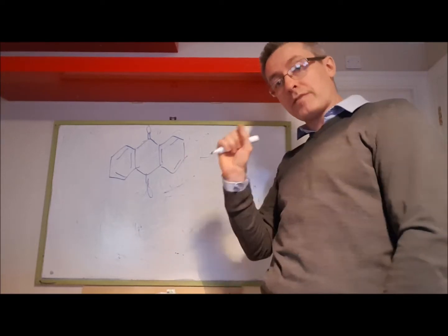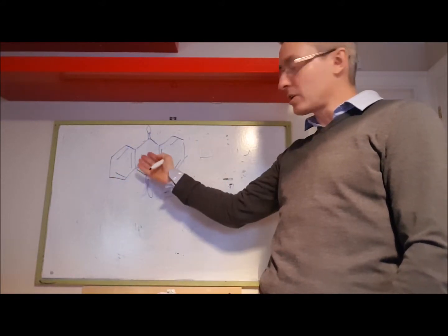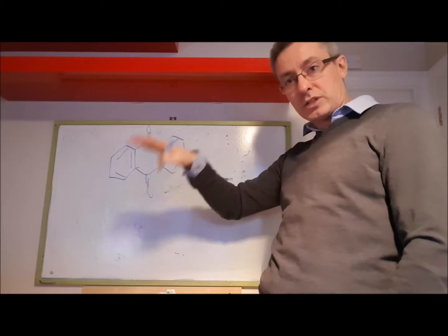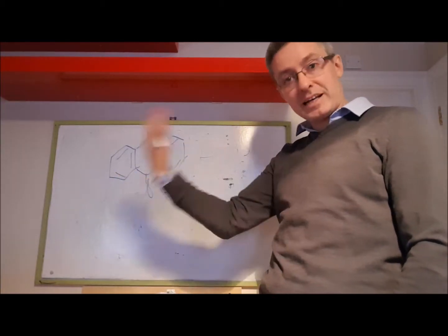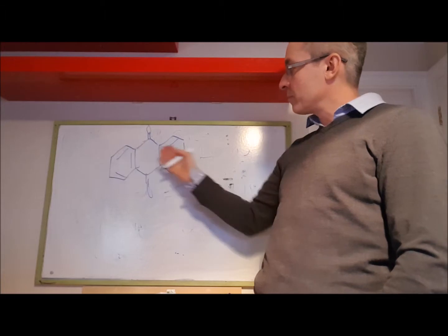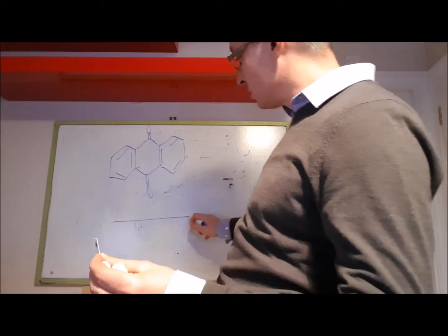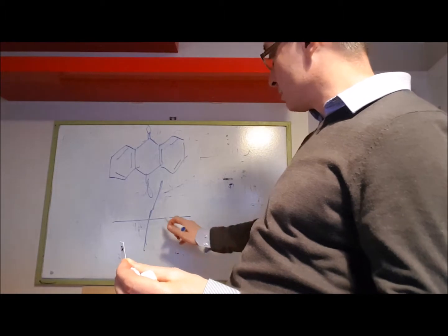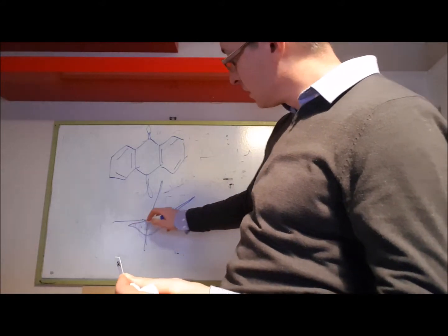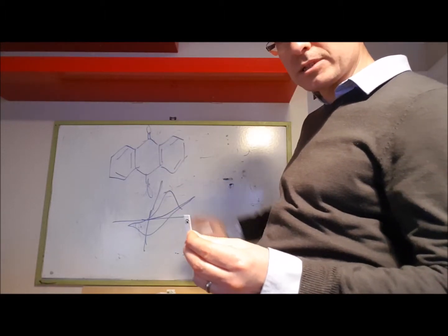It's interesting, if I was doing that onto carbon and then using the electrode in an aqueous solution, I would be pretty sure that that would stay on the surface for quite a long time, because with lots of aromatic structure here, it would stick well to the carbon surface. Of course, in oil, it might come off, so that's something that has to be investigated. But it's worth a try. If you cast it deliberately onto a carbon surface, once you've optimized, you'll be able to do CVs. Like if I scanned up with positive on the first one, I wouldn't get it. Then I'd get some sort of reduction, and then an oxidation. And again, the oxidation and reduction of that is pH sensitive, which you'd see in the peak position.